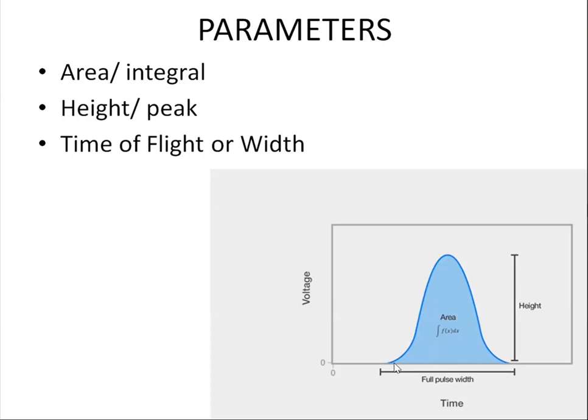Okay, so you see how much data is generated. For one particular cell signal hitting the detector, a pulse is generated. The pulse is different for a forward scatter, different for a side scatter, and for every fluorescent parameter it is a different pulse. Similarly, for one cell, these many pulses are generated, and you are going to analyze around lakhs of cells, so so many of these signal pulses will be generated.